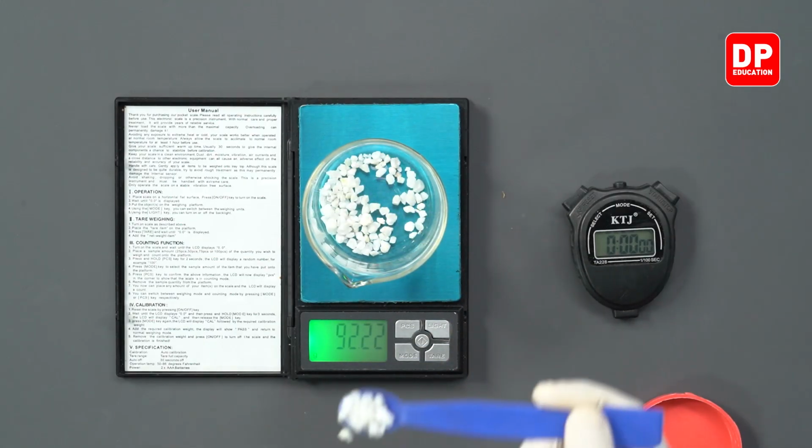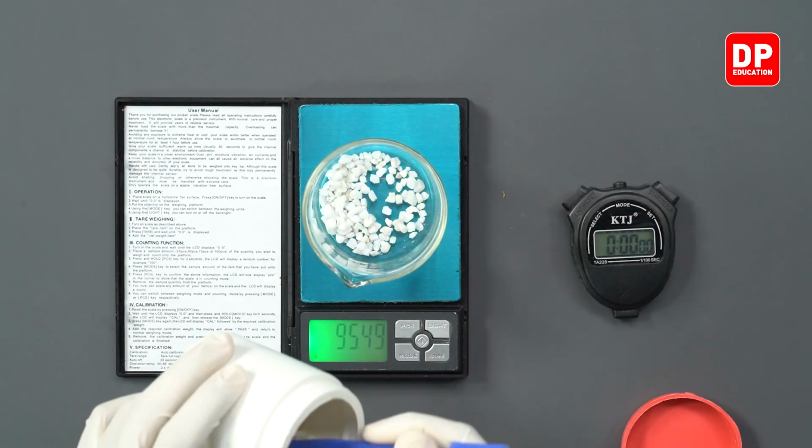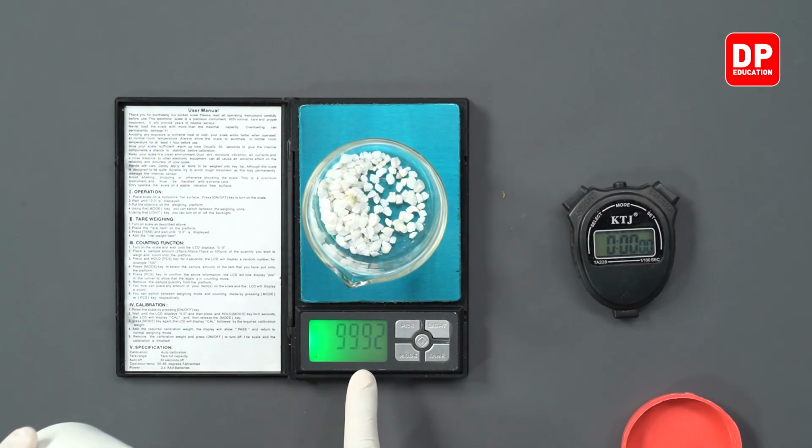So if we want to take 100 grams of calcium carbonate, we will have to get a final reading of 179.06.